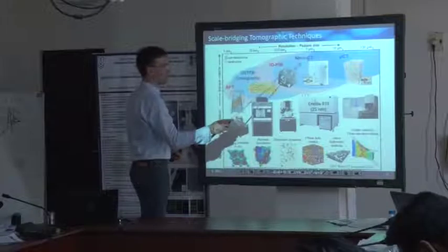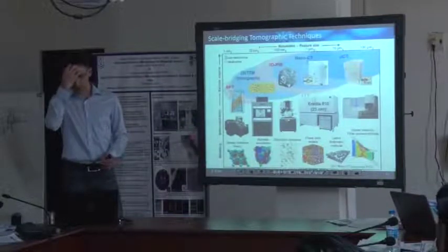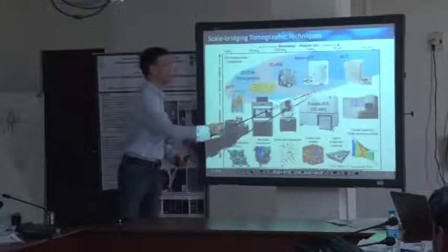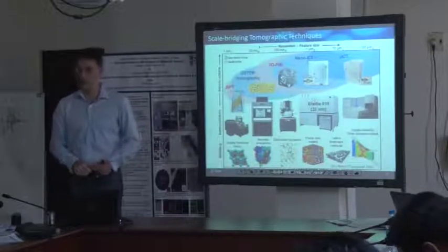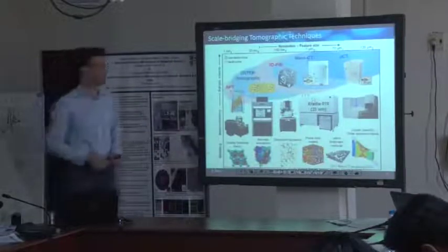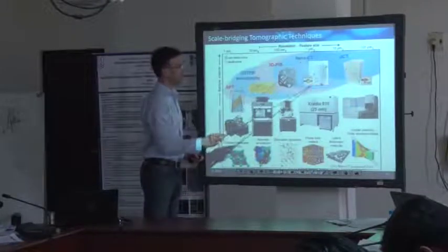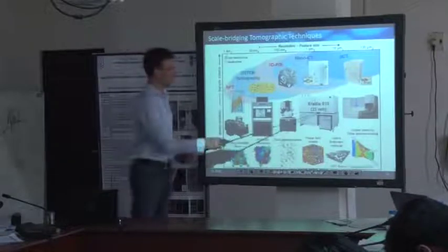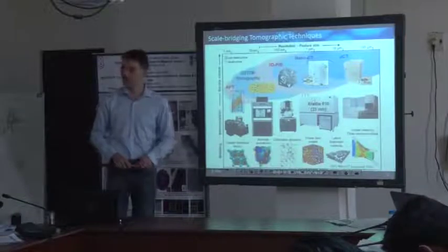Nowadays, there is a so-called nano-CT available with a totally different imaging system. In former years, people realized nano-CT at synchrotrons with a very bright source. Nowadays, there are even commercial tools available for the lab that allow for a resolution of, let's say, down to 25 nanometers using X-rays.